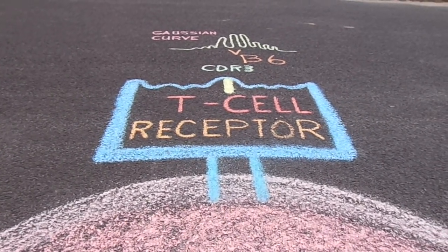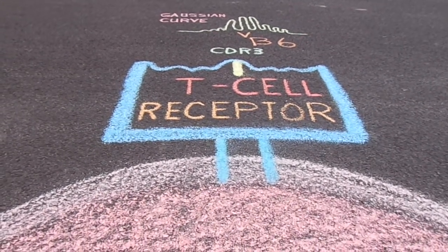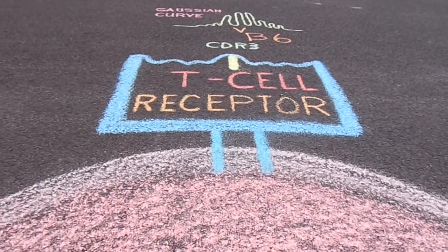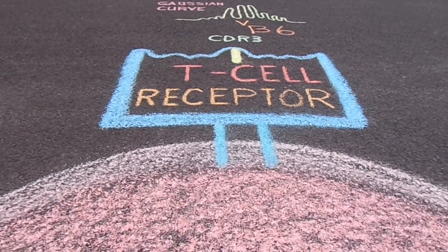Assessing the diversity of the T-cell repertoire by spectratyping. The extent of the diversity of the T-cell repertoire, either generally or during specific immune responses, is often of interest.